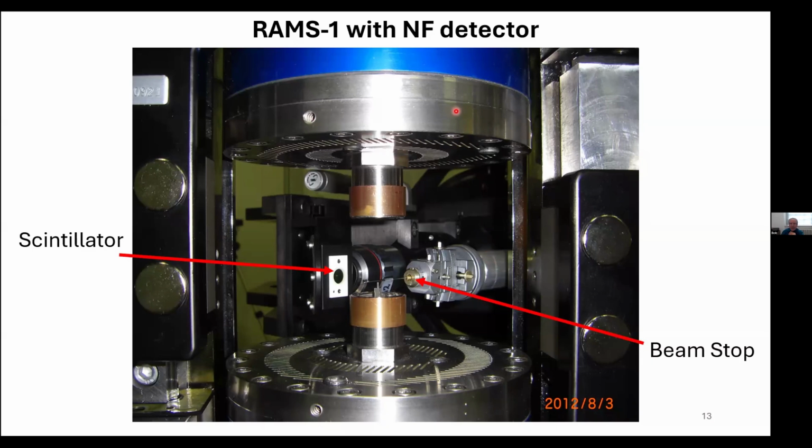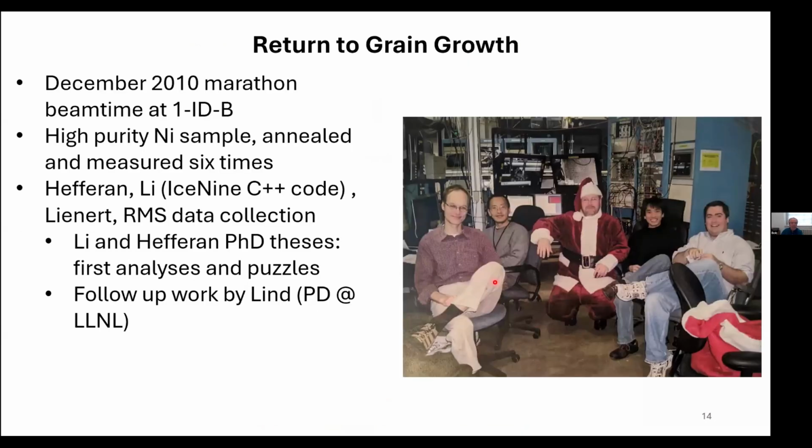And then up below and above are the precision air-bearing rotation stages, which, much to Basil Blank's credit, are essentially perfectly aligned. Okay, so that's kind of a brief look at the hardware and the methodology.